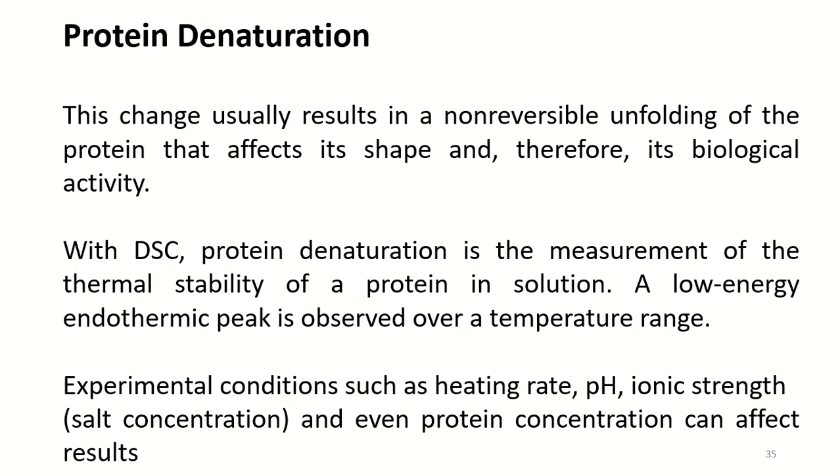With differential scanning calorimetry, protein denaturation is actually the measurement of thermal stability of a protein in solution. A low energy endothermic peak is observed over a temperature range.